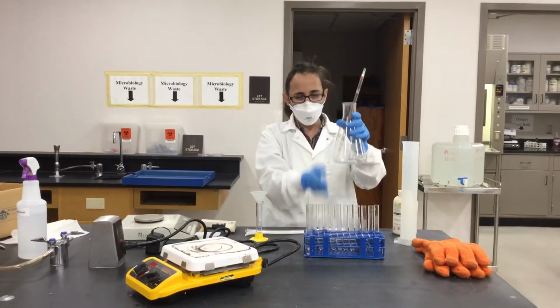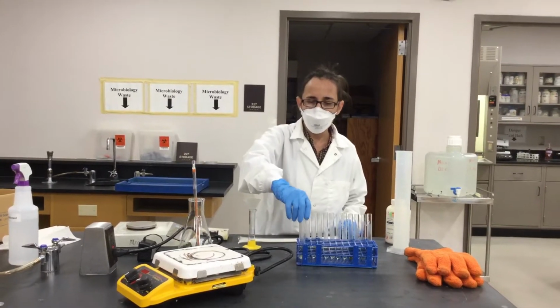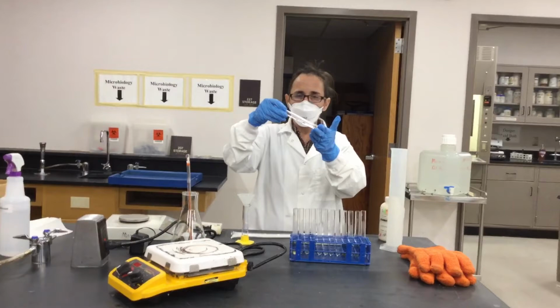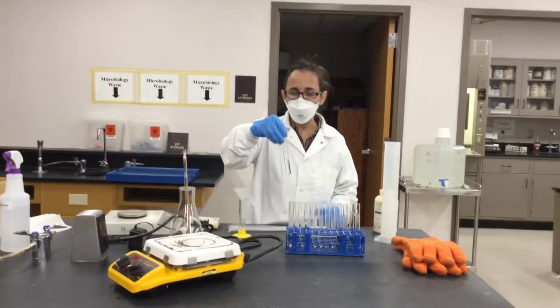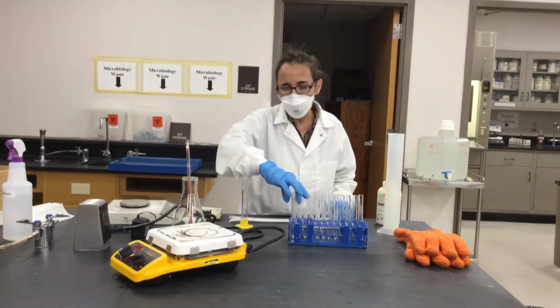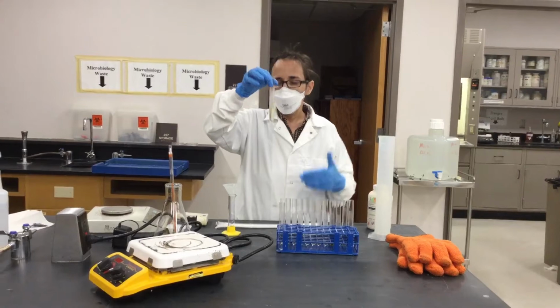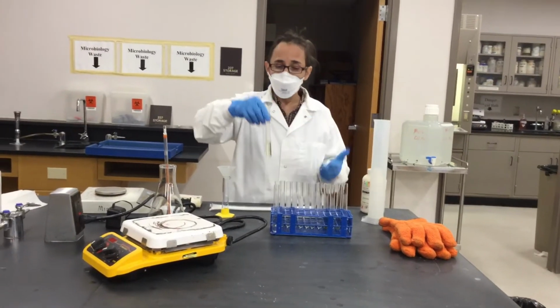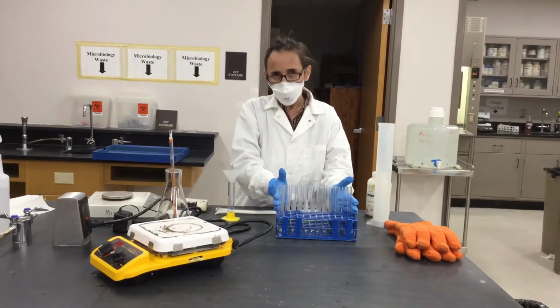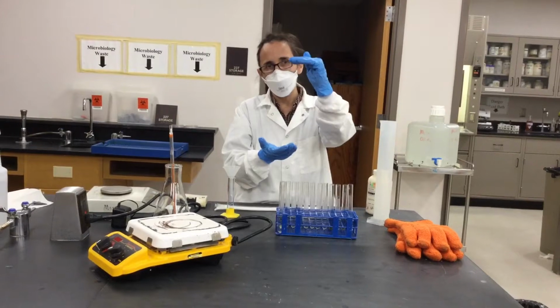Run this flask into the test tube. Now, one thing that I find out is that actually when I had these slants made of water, this one holds 10 milliliters, and in order to achieve the same result, I end up adding 8 milliliters or so of media. The difference is just because the media is denser than water, so it takes less volume to achieve the same height.